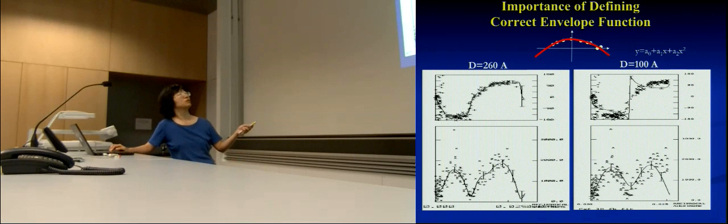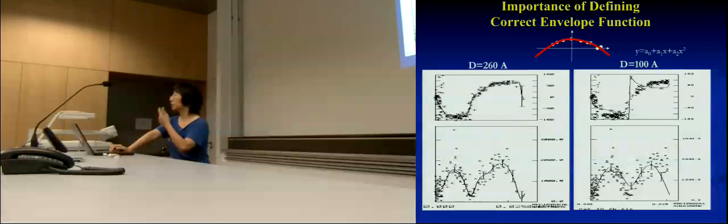But for something like this, when you put it into the program, then it doesn't fit. That usually means that there's something that you didn't realize about your protein. It's not that the program is going wrong. It's because the value you put in is not realistic for that protein. So you should know how your protein behaves.